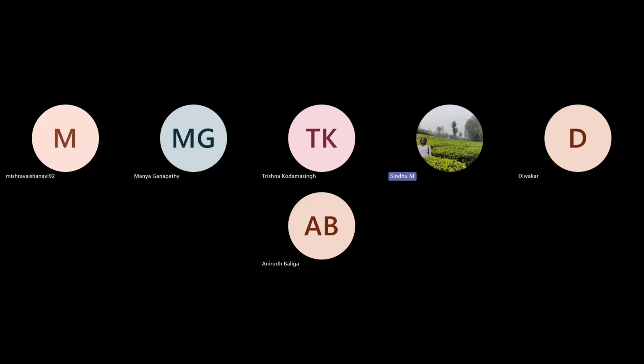And then these numbers can have a range of values, and that depends on the bit depth of the image. For example, a 1-bit image will just have 0 or 1, so you can just see two different colors here. But a 2-bit image would have 4 values, 2 power 2, so you see 4 different shades in the image. As the bit depth increases, the image clarity is higher.